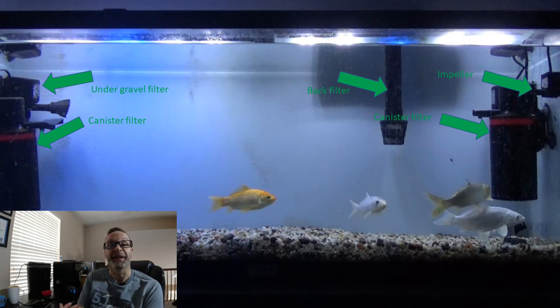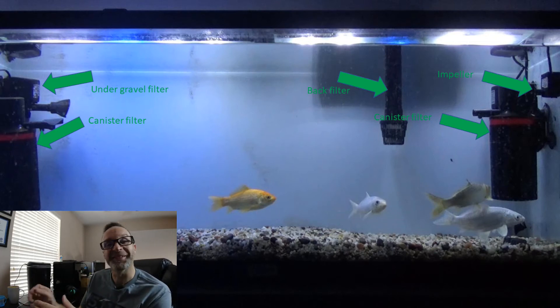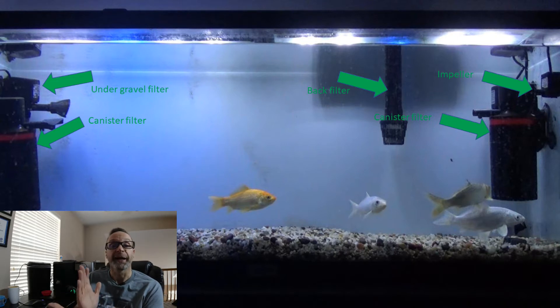So let's look at the tank setup. I'm going to glance over here where my screen is. We have four 55-gallon fish tanks. In each tank we have three koi and one goldfish.